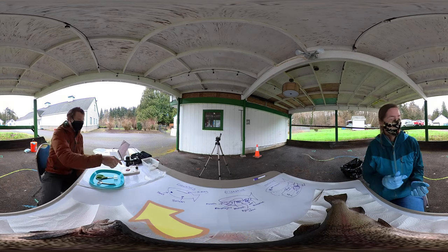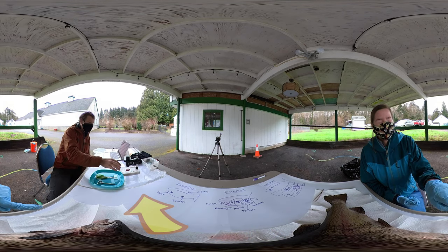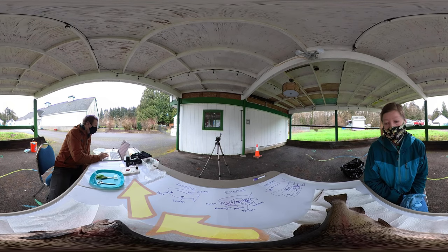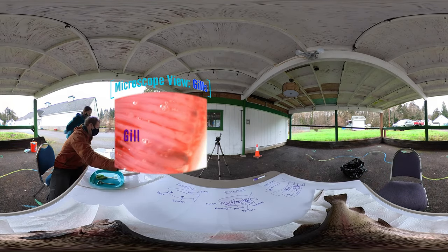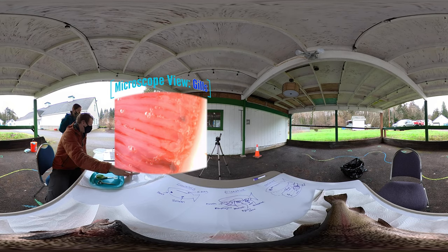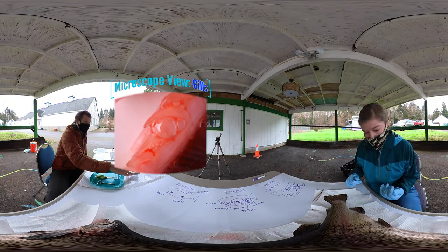I'm going to put this under this little microscope here. If you scroll over on the video to look where I am, I'll have a little screen here so you can see what I'm seeing. Here's the gill. All these little bubbles aren't actually part of the gill — they're just there because we did the dissection. Look at all that pink where the blood comes close to the surface to get the oxygen. And here are the gill rakers — those little spines that help keep debris out of the gills to keep them clean and healthy.